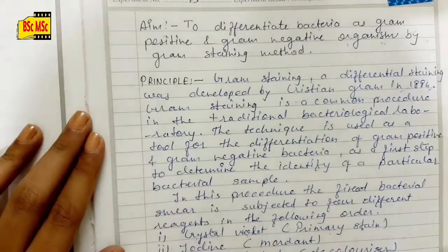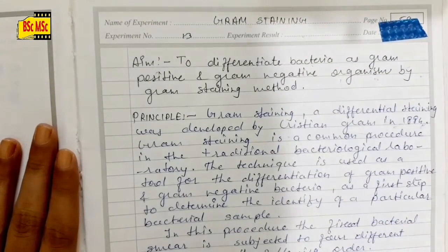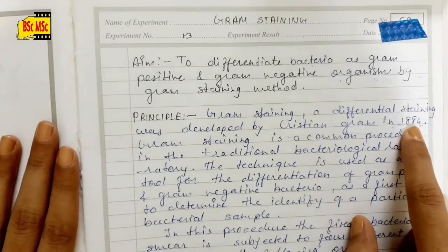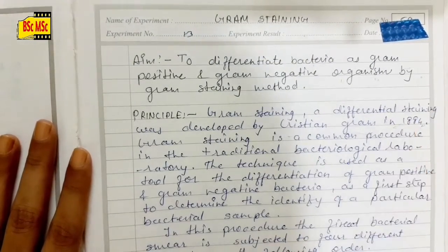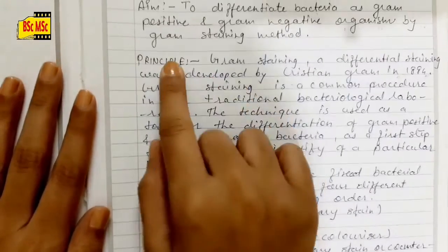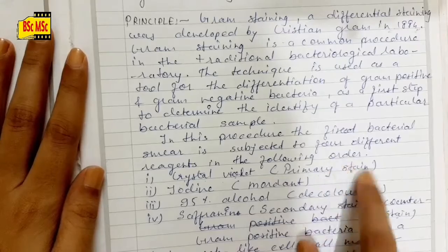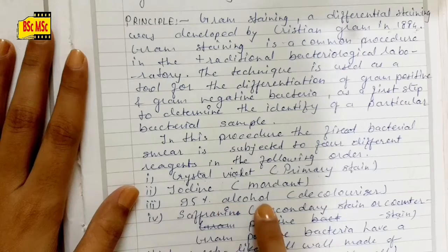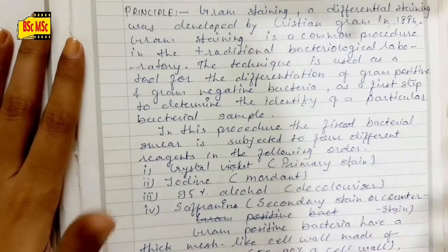Okay, so let's start. In gram staining, we all know that it was developed by Christian Gram in 1884. This is a really important question and it may come in FAQs. Some more important viva questions generally come from the principle of the gram staining method: crystal violet is known as the primary stain, iodine is the mordant, 95% alcohol is the decolorizer, and safranin is the secondary stain or counter stain.